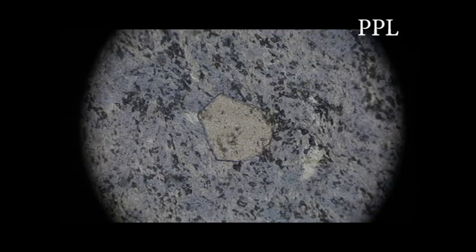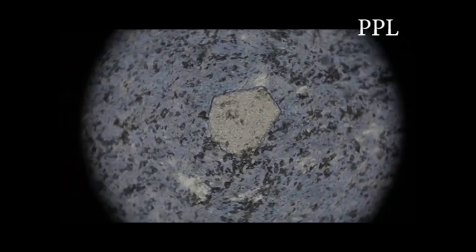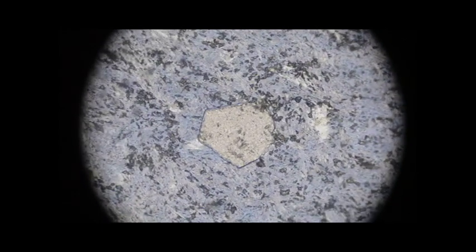In an isotropic mineral, light is treated the same way in all orientations of the mineral. So no matter how we rotate the stage or orientation of the crystal, the color will always be the same. So isotropic minerals are never pleochroic. And that also explains why in cross polars, they appear completely black.